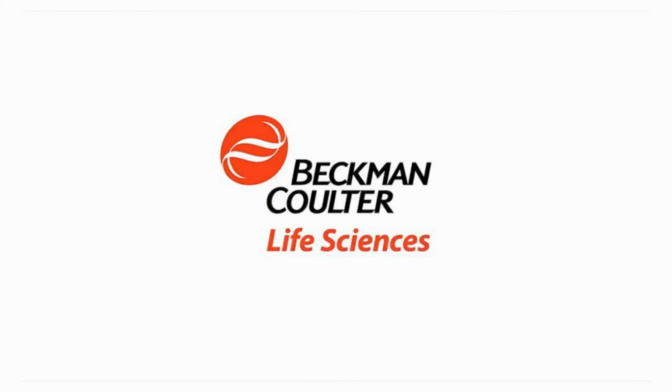The molecular biology system is another example I'd highlight, where the type of labware and the reagents and the process that we do on there today are very different than what we were doing 3, 4, 5 years ago. So not only do the hardware, software and automation components of the systems change over time, but the biology and the processes significantly change over time as new kits become available, new standards of best practices, and new reagents become available. We adapt our process to try to take advantage of the latest, greatest technologies in all respects.